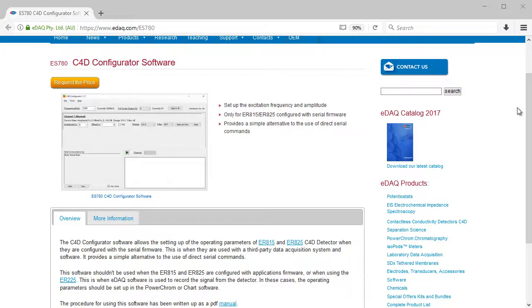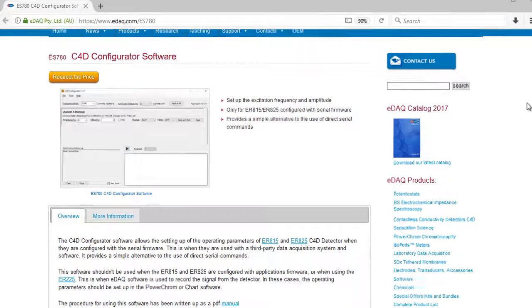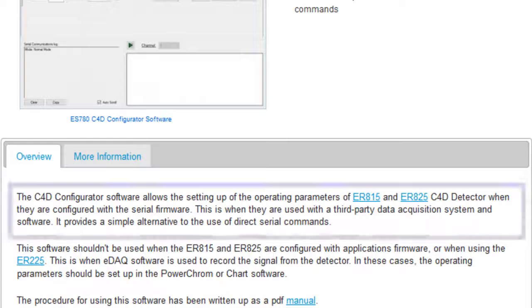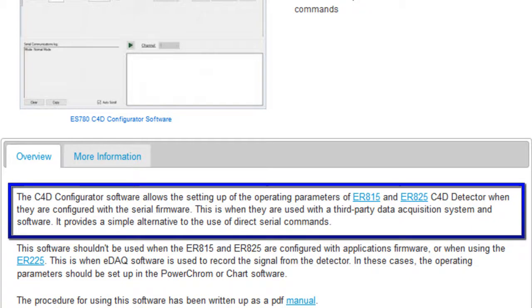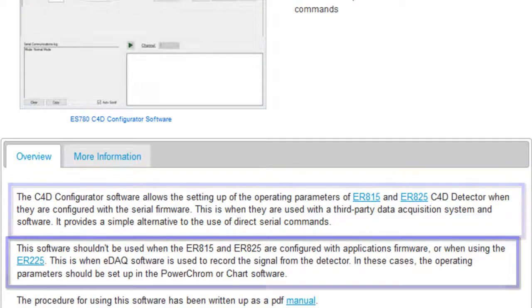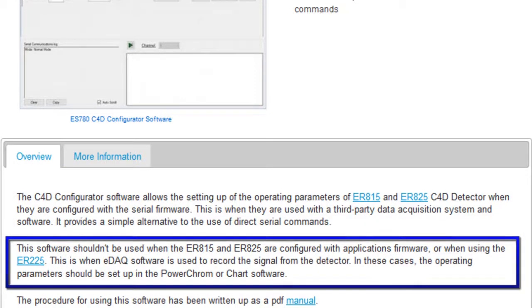The C4D configurator software is used to set up the operating parameters of the ER815 and ER825 when they are configured with the serial firmware. You shouldn't use it if they are configured with the application's firmware or if you're using the ER225.